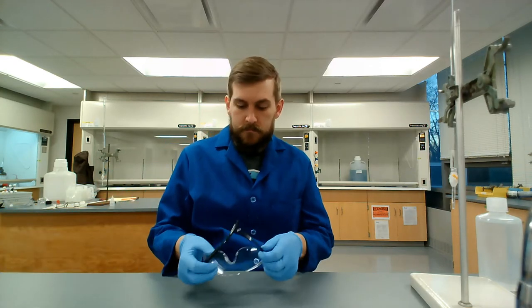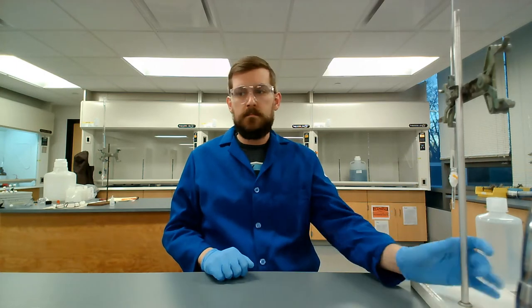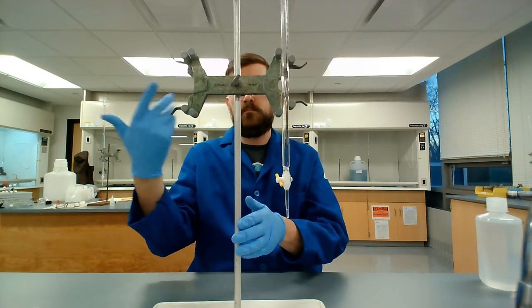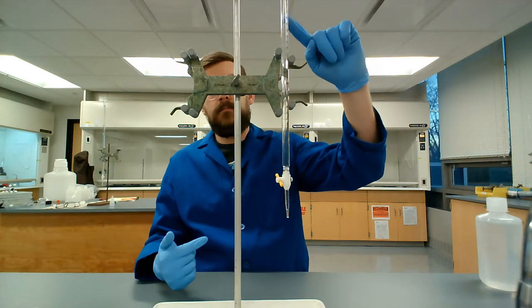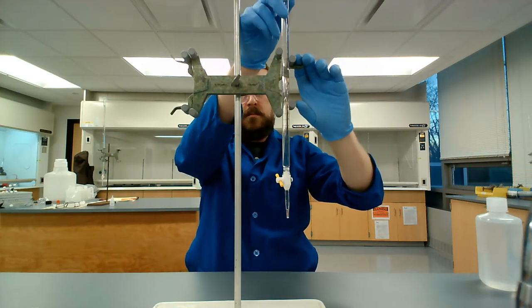All right, so today we are going to cover how to properly do a titration, but first, I need some safety goggles. Now that I've got that situated, here is the setup for our buret. We have a stand, a buret clamp, and the buret itself that goes in the clamp. It is currently filled with deionized water.